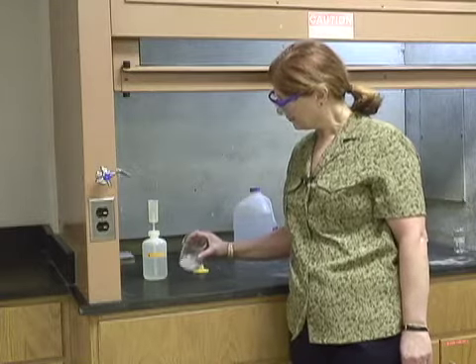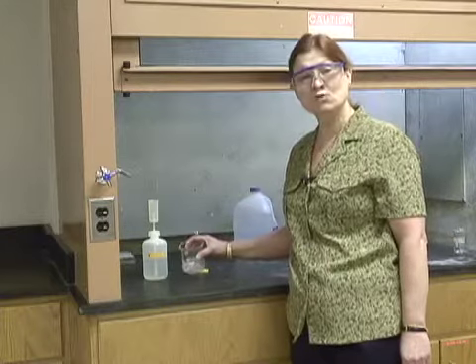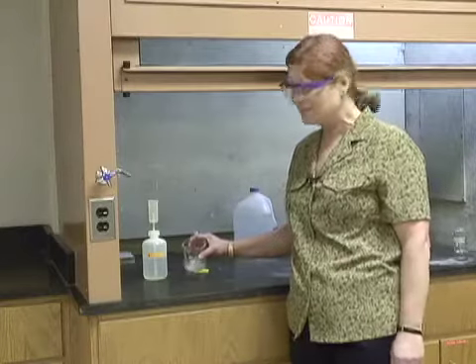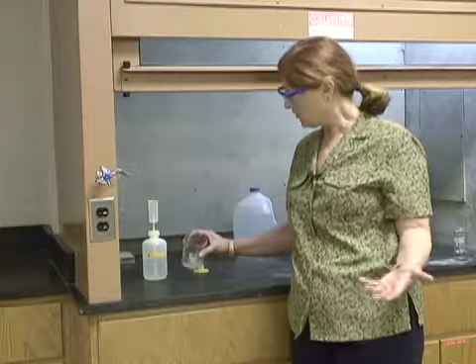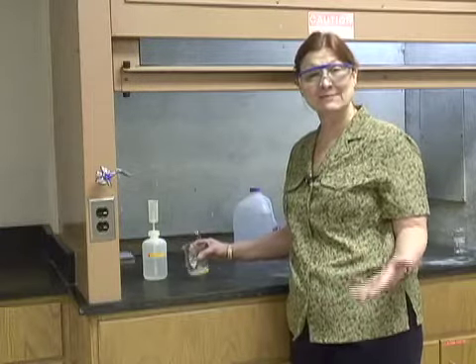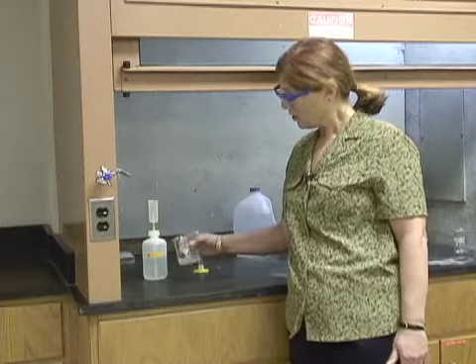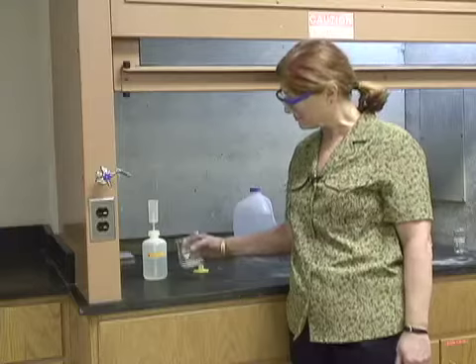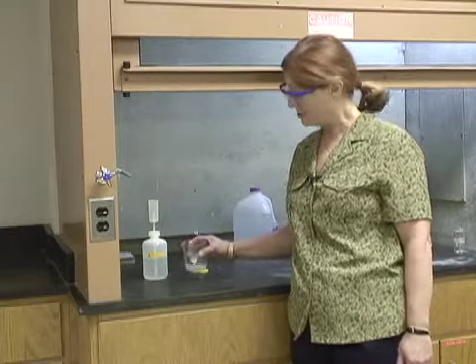Now remember, what we have in here is magnesium and chlorine. We're going to drive off the water, and that will give us a dry magnesium chloride product. We know the mass of the magnesium. Once we weigh this, we'll be able to get the mass of the chlorine and change those grams to moles. Always have to change grams to moles, because we can't make any comparisons of grams. Grams are totally different, but I know that 1 mole is Avogadro's number of atoms.